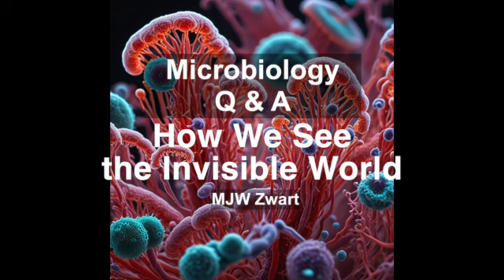Let's start with the light microscope, the workhorse of many labs. I remember using a light microscope in high school biology. You shine a light through a sample, you see a magnified image. That's called bright field microscopy, the most basic type. But sometimes you need to get a bit more creative to visualize what you're looking at. In what way?